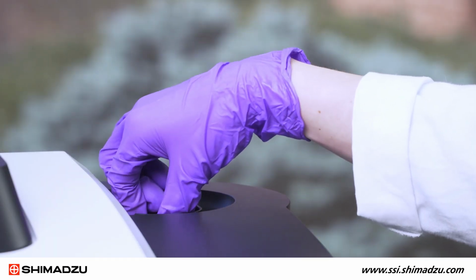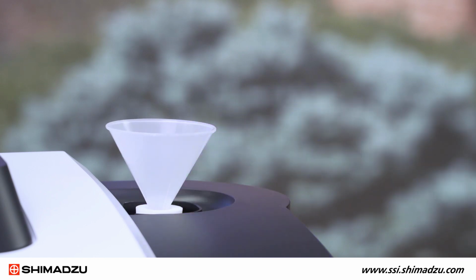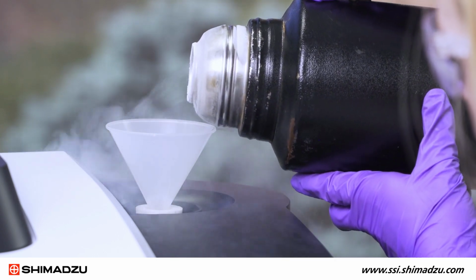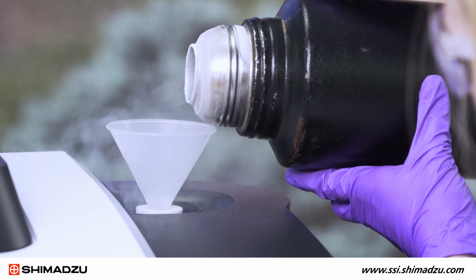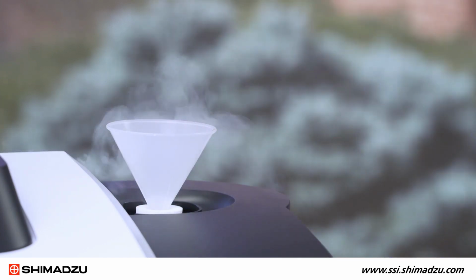Take off the plastic cover, remove the gold stopper, and insert the funnel with the styrofoam collar. The styrofoam collar allows for nitrogen ventilation during cooling. Start by slowly pouring about 25 milliliters of liquid nitrogen through the funnel, then wait for the vapors to subside. After the cloud dissipates, slowly pour another 25 milliliters and wait again for the vapors to clear up. The dewar should be sufficiently chilled after that, and the remaining liquid nitrogen can be added quickly.